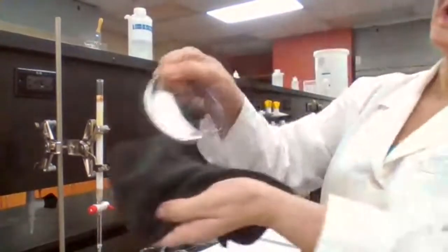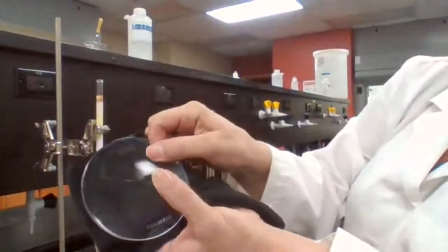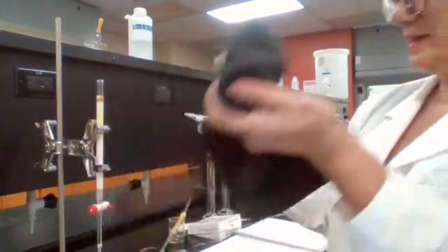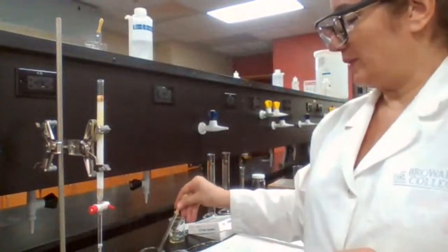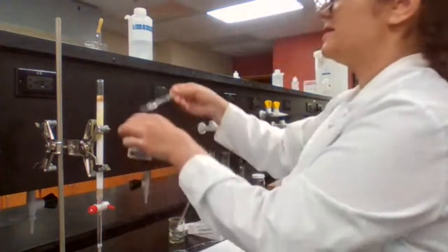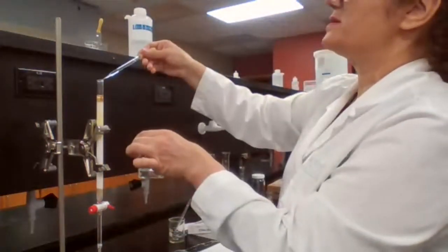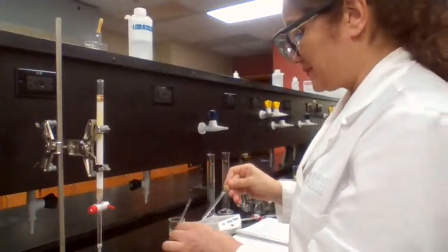And for the last one, no residue. No residue for the last one. So I can stop here and switch my solvent. I'm going to stop here, just add some so it doesn't dry before I go get the solvent for the next one. I'll be right back.